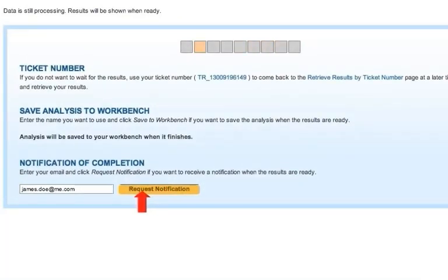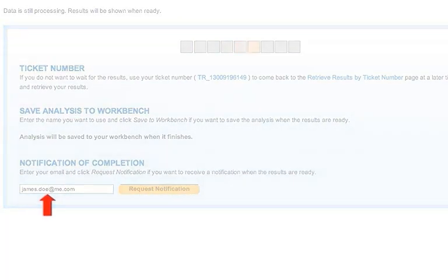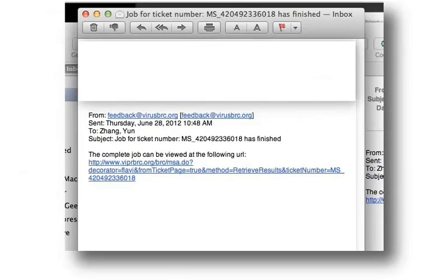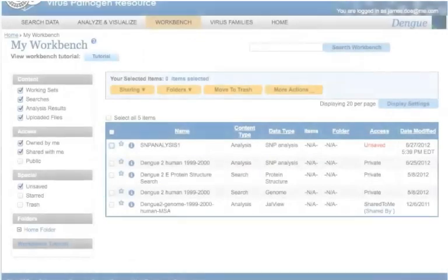You can also request an email notification of completion by entering your email address. When the results are ready, you will receive an email with a link to the results of the analysis.